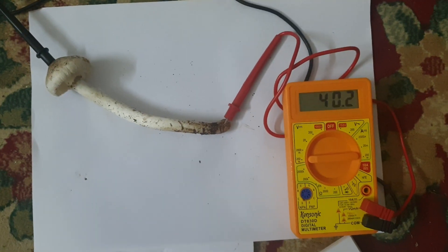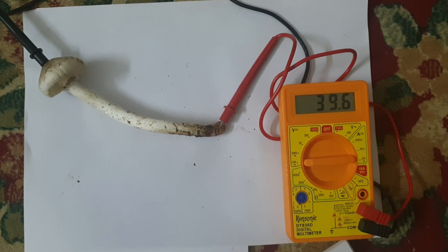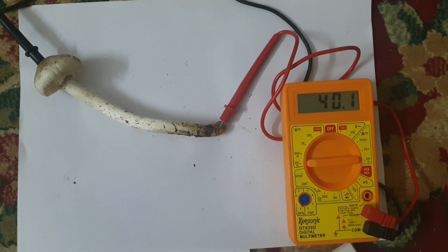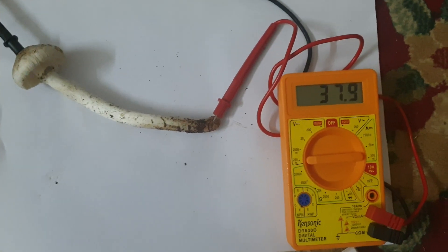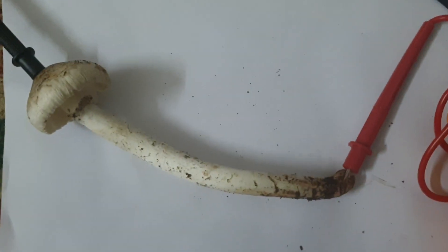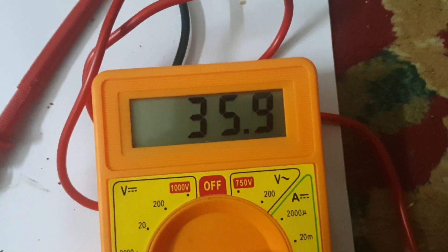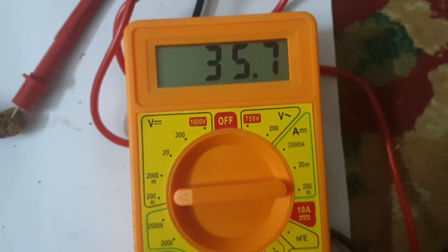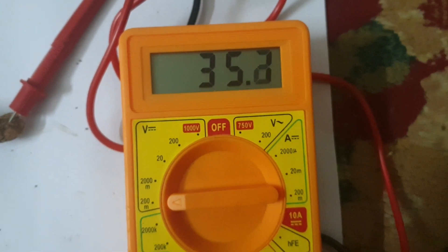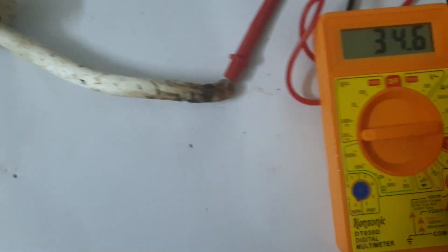This is the first experiment in the world measuring bioelectrical parameters of Thermitomyces developing fruit bodies. Thermitomyces specimens are selected here and electrode probes are now inserted on two ends. Measurements of the bio-voltage are being done here and we can see the fluctuating readings — around 35 millivolts.